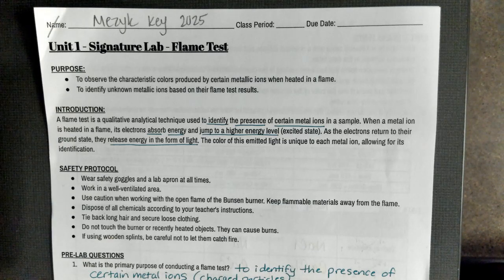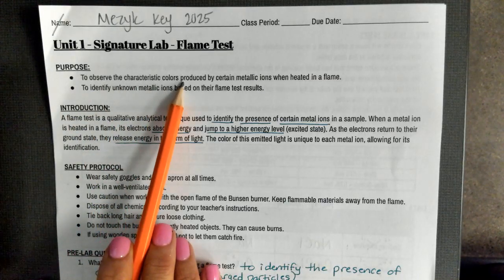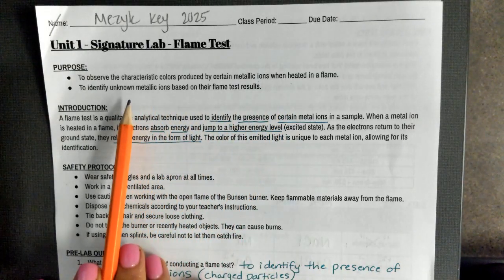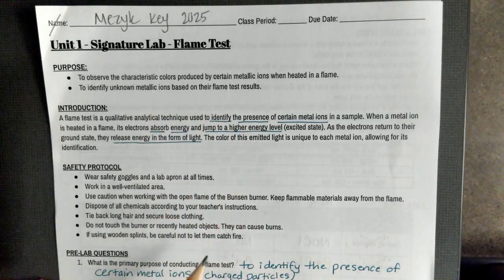Hello, ladies and gentlemen. We are going to be looking at the signature lab for Unit 1, which is the flame test. So the purpose of this lab is for you to observe the characteristic colors produced by certain metallic ions when they're heated in a flame, and also to identify unknown metallic ions based on their flame test results.